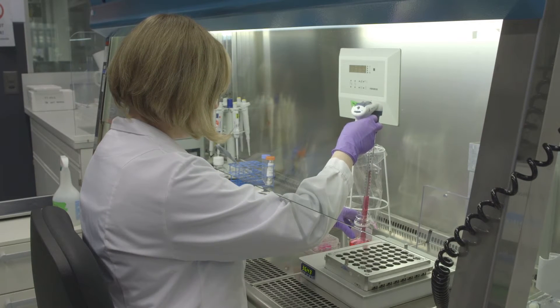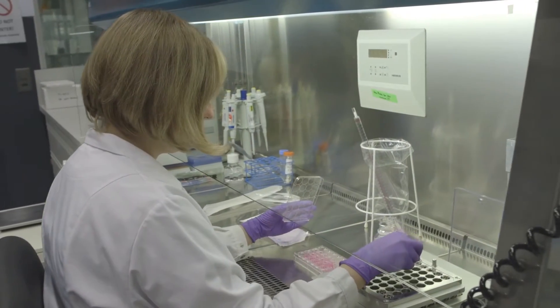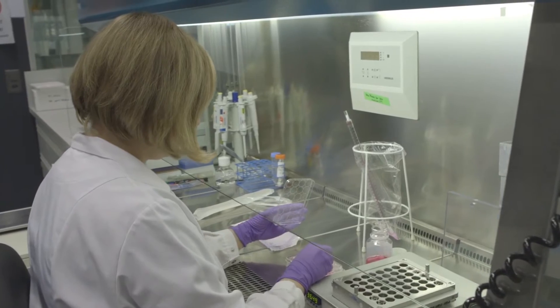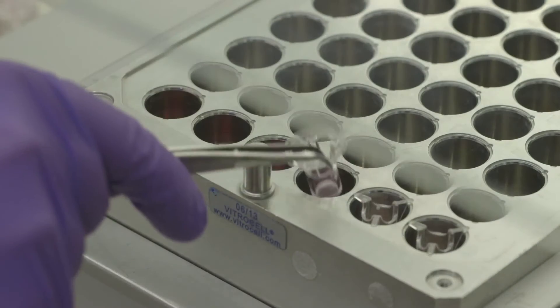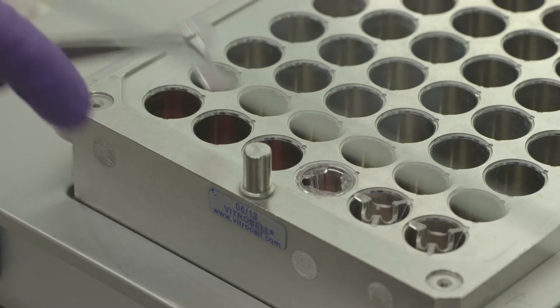Firstly, the scientist prepares the cells on little plastic structures called inserts. These inserts allow the cells to be grown in a physiologically relevant way, where the bottom of the cells are exposed to liquid and the top of the cells are exposed to air.